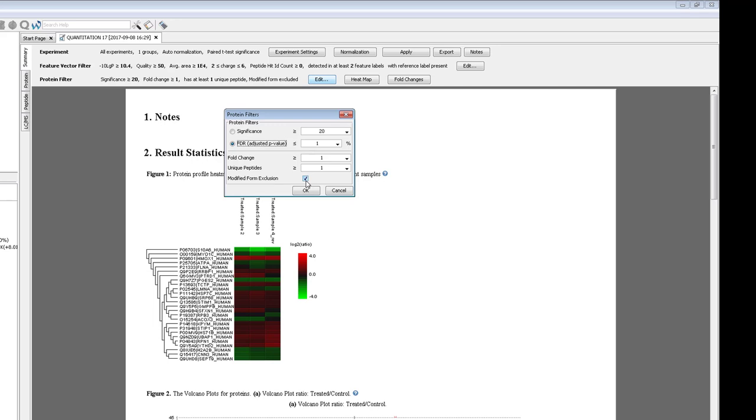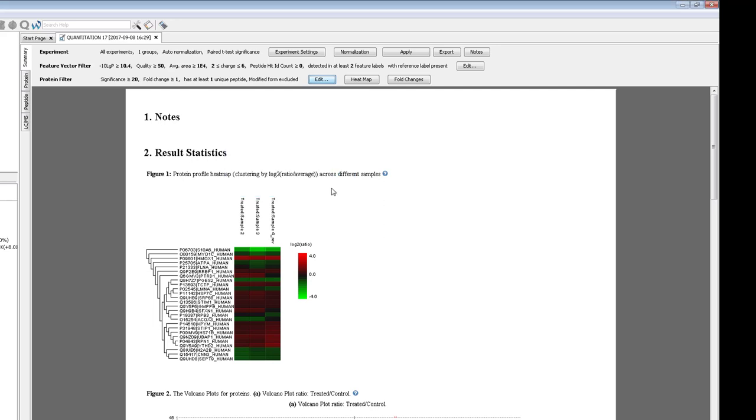If both an unmodified and modified form of a peptide are found, the total abundance of the peptide is split into two features, so it's best to remove it from the protein quantification. Once you set these filters, you can be confident that the proteins and peptides shown in the protein and peptide table are accurate.